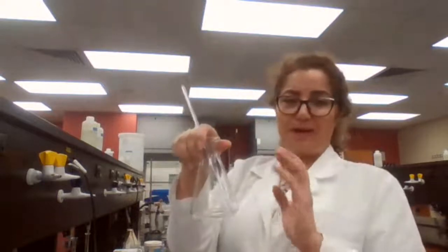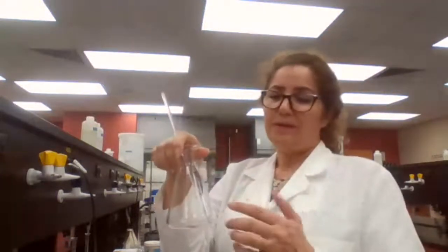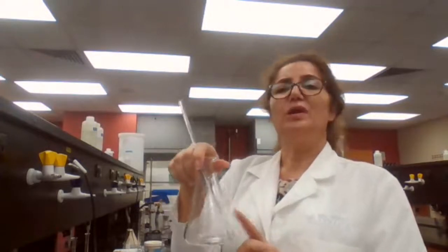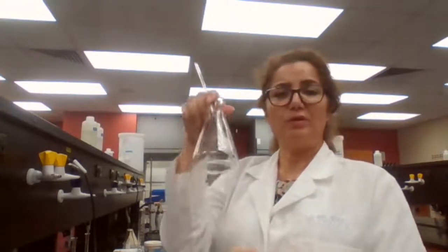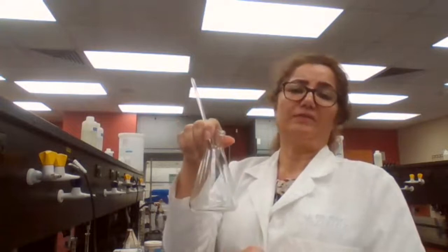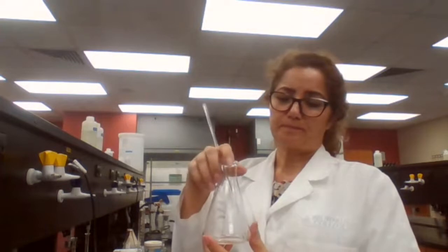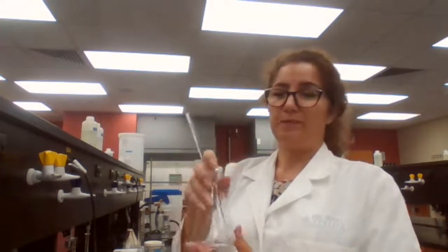If you used too much solvent to begin with to dissolve your sample, and that was just by mistake, your solution is not saturated. Now you have to lower the volume. How would you lower the volume of the solvent? Can you pour some out?